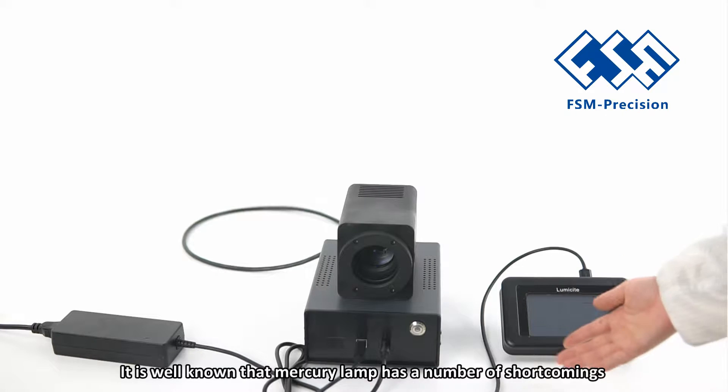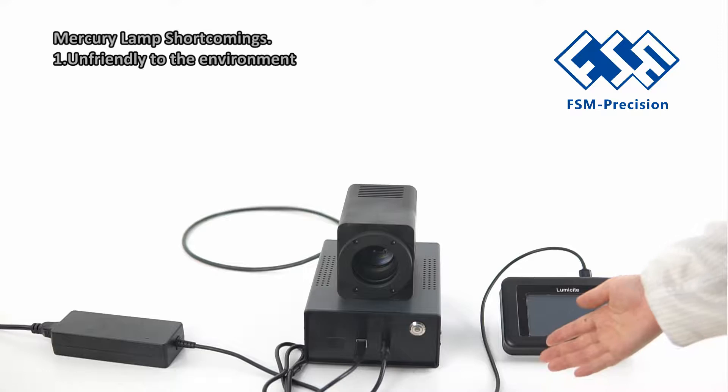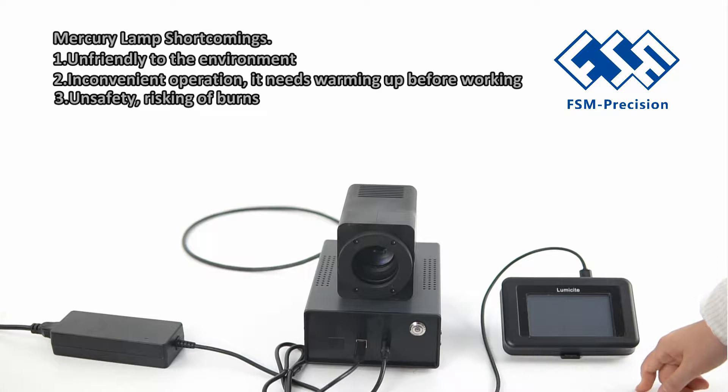It is well known that mercury lamps have a number of shortcomings. First, they are unfriendly to the environment. Second, inconvenient operation — they need warming up before working. Third, unsafety, risking burns. Fourth, limited lifetime.